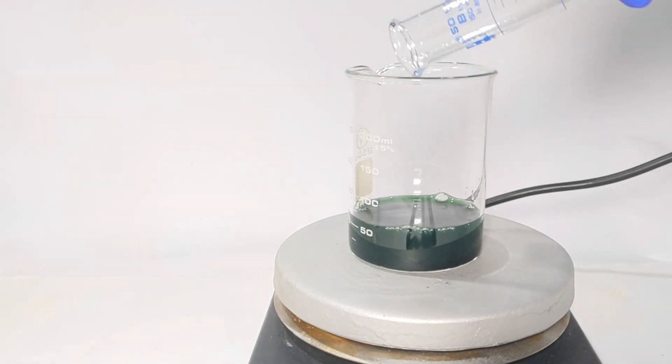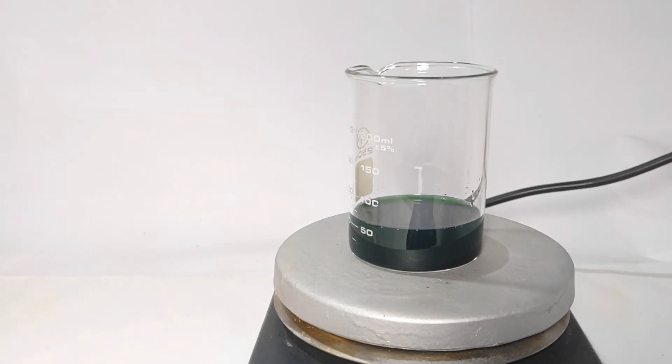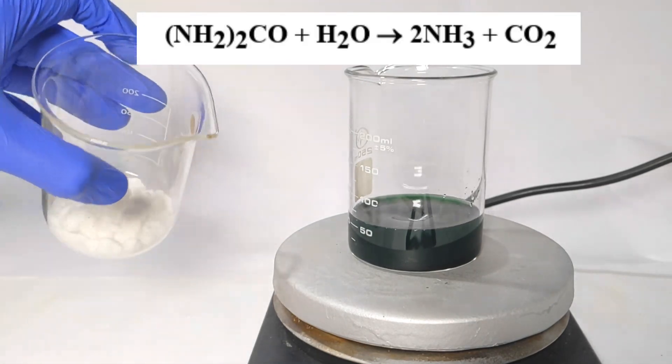1.4 grams of chromium III chloride was placed inside. Then 50 milliliters of distilled water was added. Chromium III chloride quickly dissolves to give a deep green solution. Now 10 grams of urea was added to it.